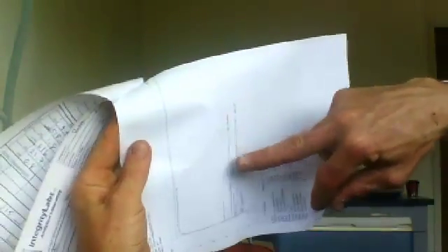Anyway, there's your chart. Two beautiful peaks. There's your THC peak. There's your CBD peak. You've got your CBN, CBG, and all the good stuff. THCV there. Beautiful. Okay, now we're getting to the second one.